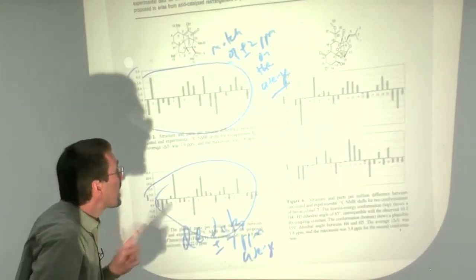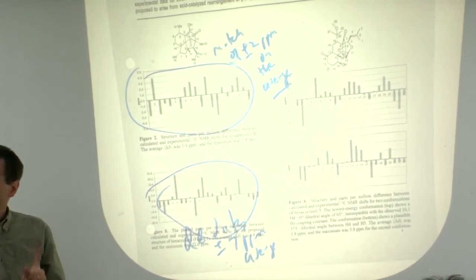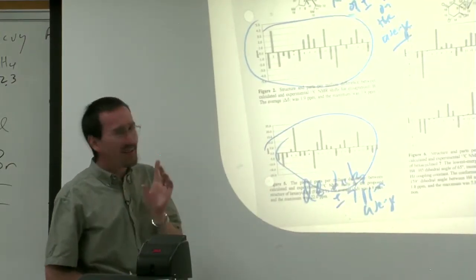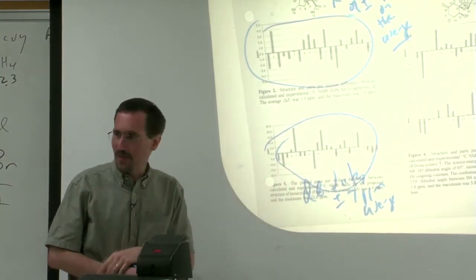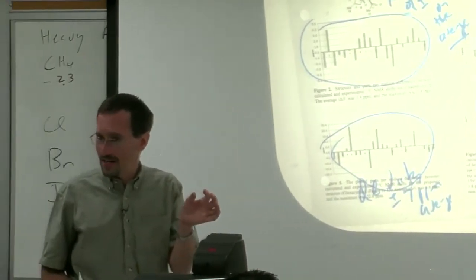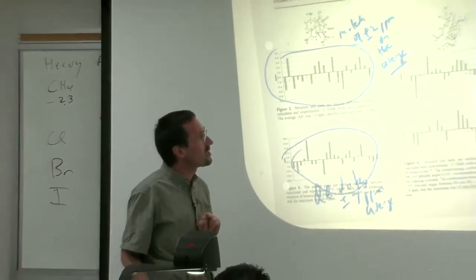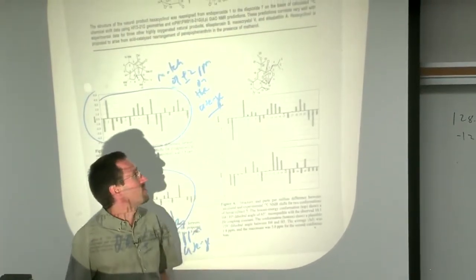Now, he then went ahead and thought, this guy got the structure wrong. And he had a hypothesis of what. So not only did he think that the synthesis was a fraud, he thought that the structure wasn't even right because it didn't match. So he reinterpreted the published structure of the molecule, the one from the Journal of Natural Products, where they had isolated this molecule and thought it was this structure, reinterpreted the data, and considering biosynthetic factors, came up with what he believed the correct structure to be.